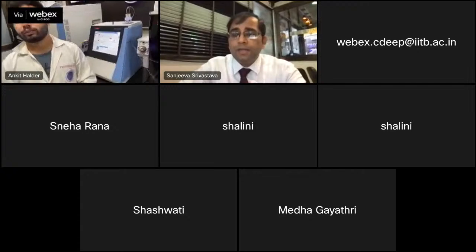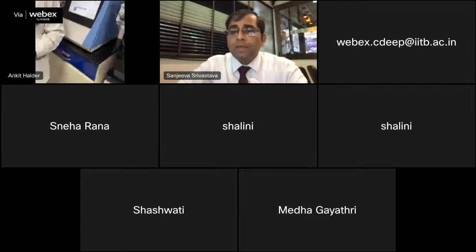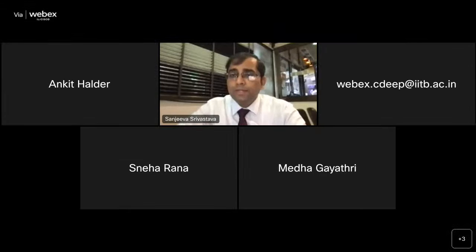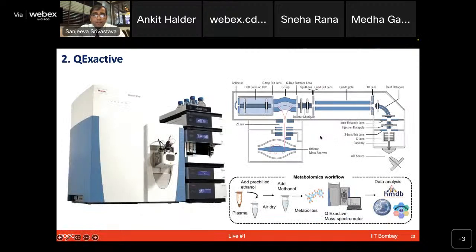All right, thank you, Abhilash. What you see in the front is a Nano LC. While you can use different types of chromatography, you can use a UHPLC, since we are looking at peptides right now for proteomics-based analysis, it is good to have the Nano LC so that you can utilize very small amounts of your peptides, inject them, and still do the proteomic analysis. But of course, depending on your application, you can interface these instruments with different types of HPLC platforms.